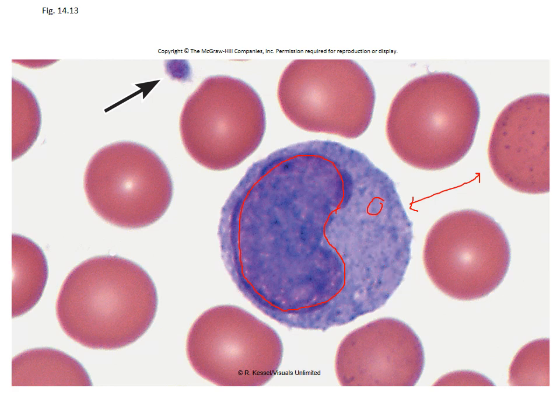Now, again, what I wanted to make sure I remind you of, these are called macrophages. And so throughout this semester in lecture, when we're looking at different things, we're going to talk about macrophages in different organs, in the lungs and in different areas. Understand that a macrophage is simply a monocyte that is no longer traveling around inside the blood vessels.